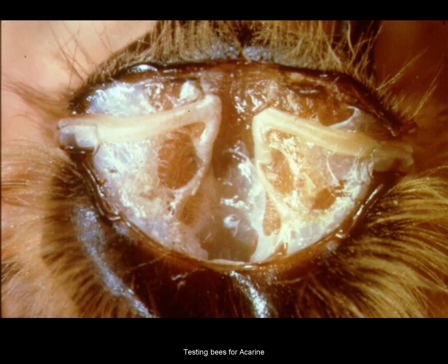There are further spiracles down the body and they're smaller, so it's in here the acarine mite would go if it's going to get into the bee and if it's in the colony. In the next photograph we're looking at, the left hand spiracle and trachea are blackened, and this is infected with acarine.